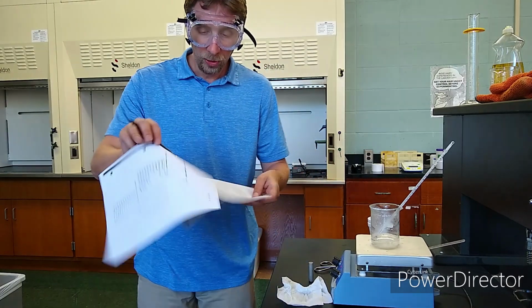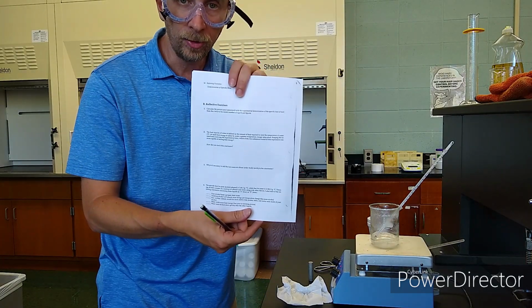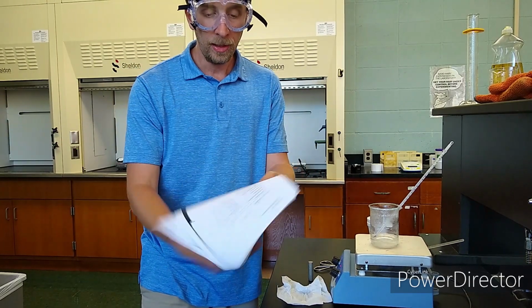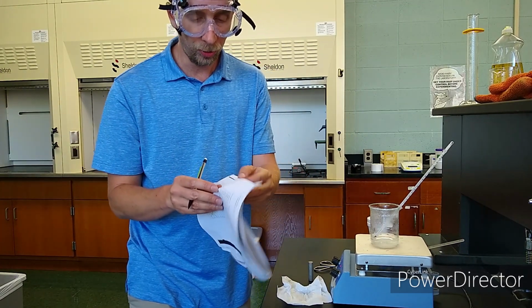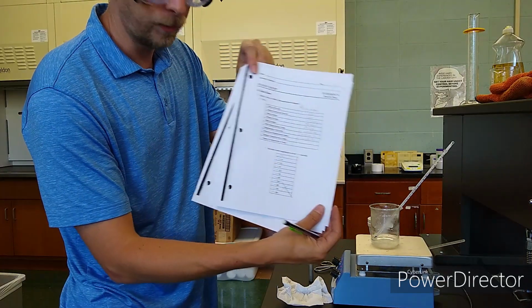All right, so I leave it to you guys to finish up with all of the reflective exercises, but even more importantly is to make sure, so on your trial 1, we did aluminum. Okay, we did aluminum for trial 1.